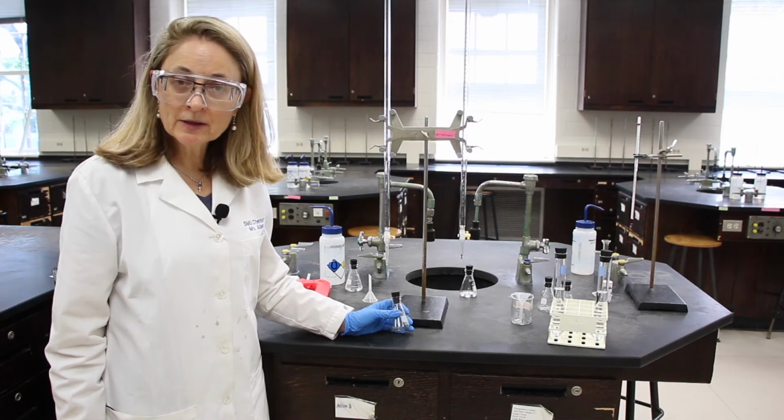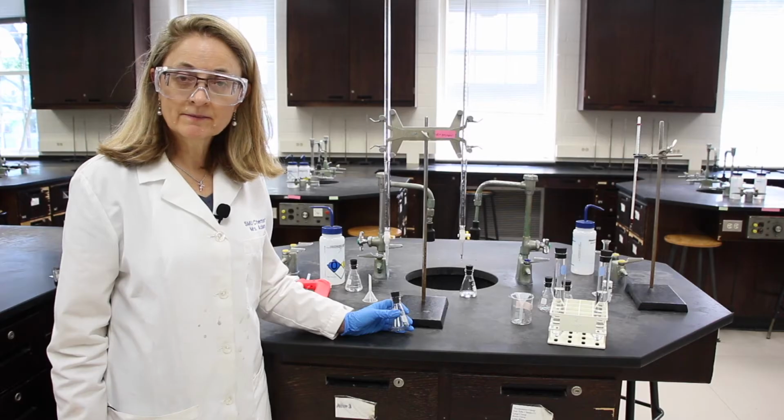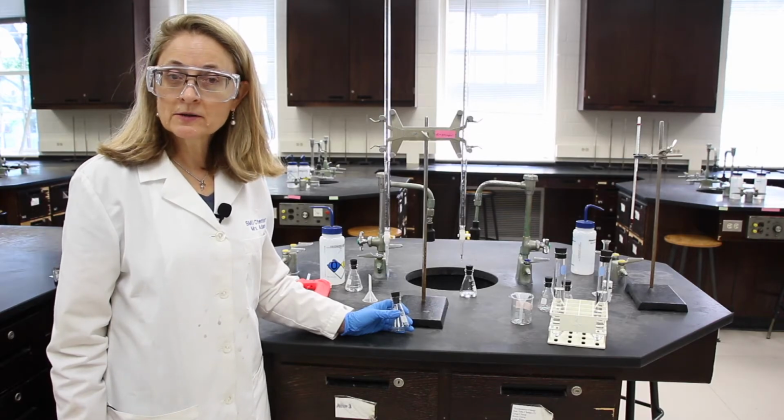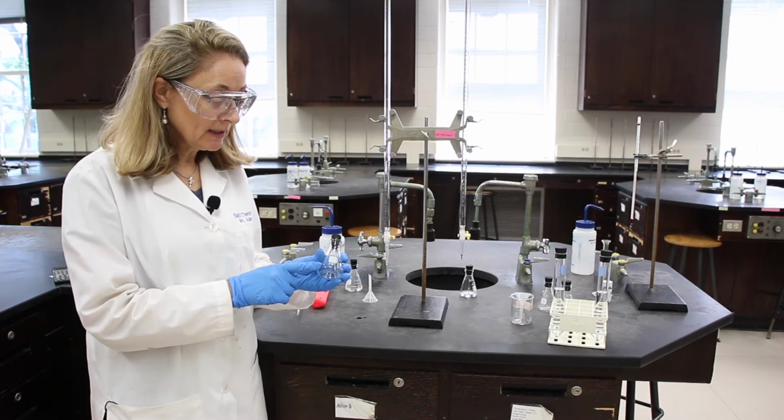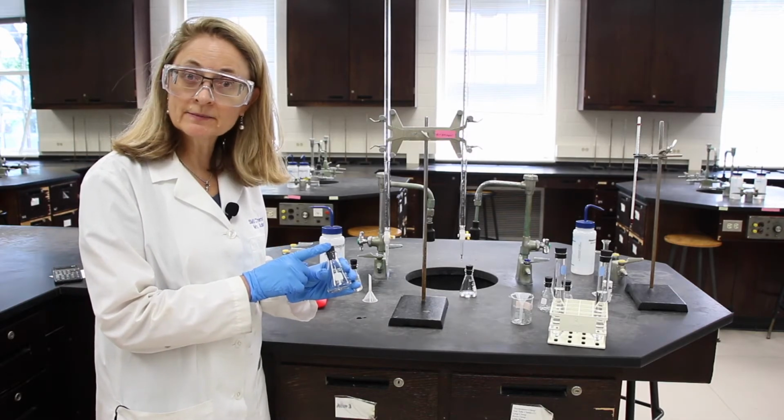In Part 3, we'll determine the densities of the 2 solutions we just made. The first step in this part is to weigh a clean, dry Erlenmeyer flask with a stopper. Let's do that.